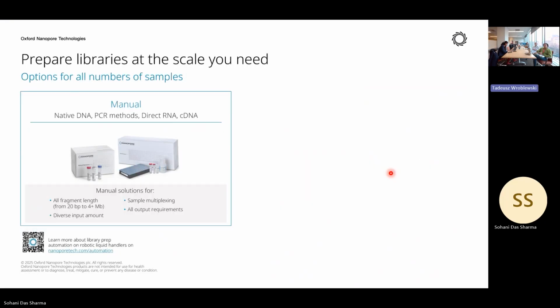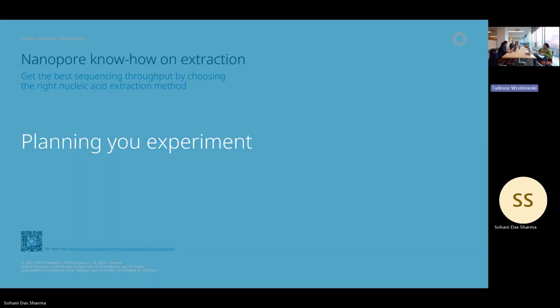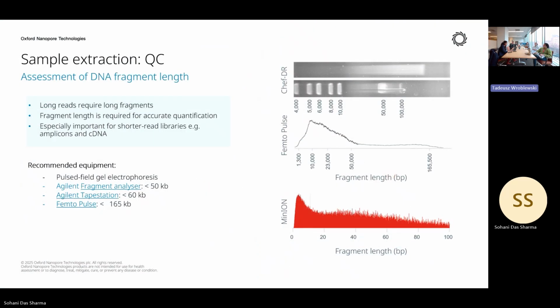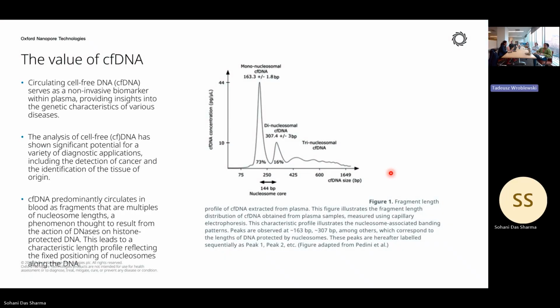I have a question. Sure. What's the difference between this model and the MinION? Because I used the MinION before. Oh, okay. And that one did get a few air bubbles. Yeah, so the chemistry is the same, it's the nanopore chemistry. But the flow cell or the platform is completely different.